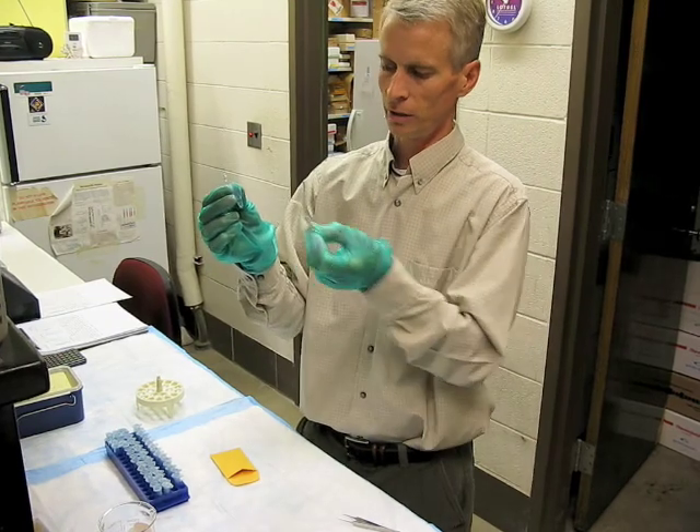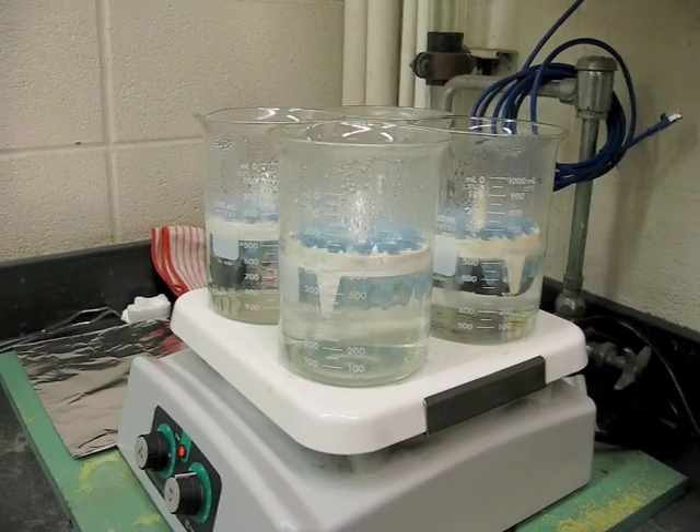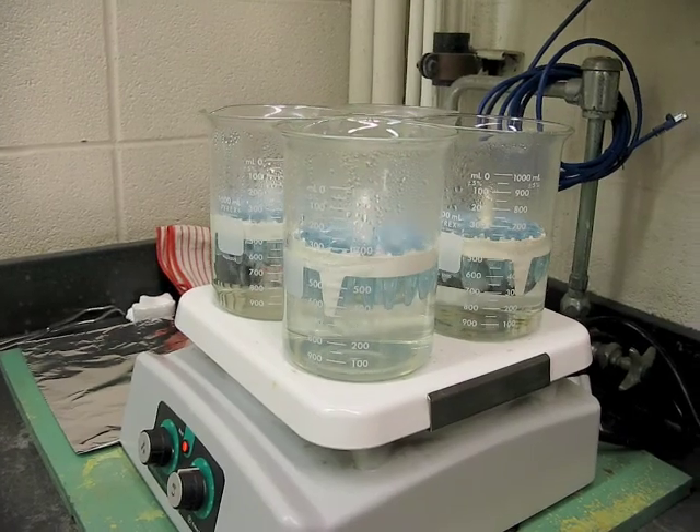In here is just sterilized water along with a little resin and a little heat. Then we put them to boil for about 8 to 10 minutes, and that boiling is going to just burst open the cells and release the DNA into the solution.